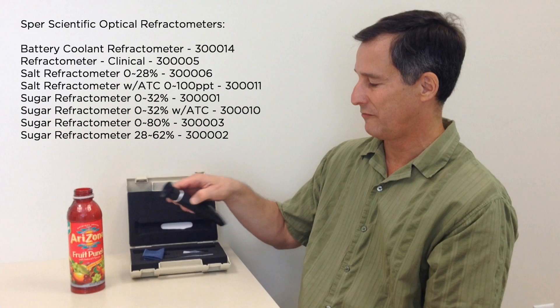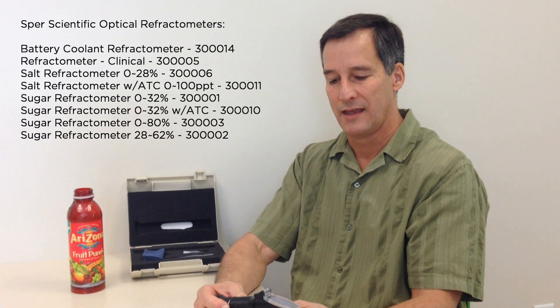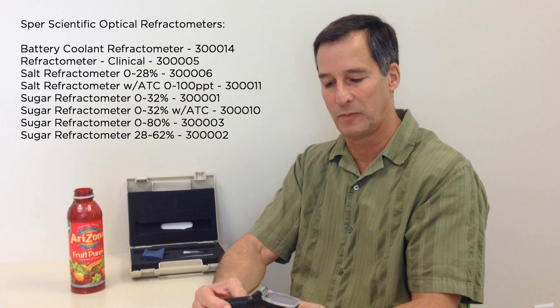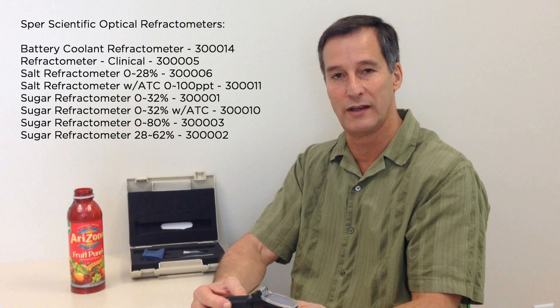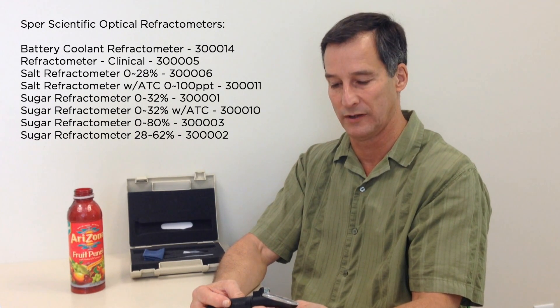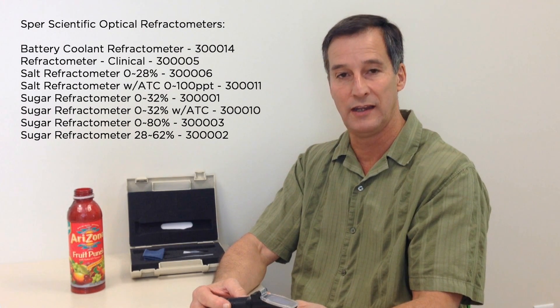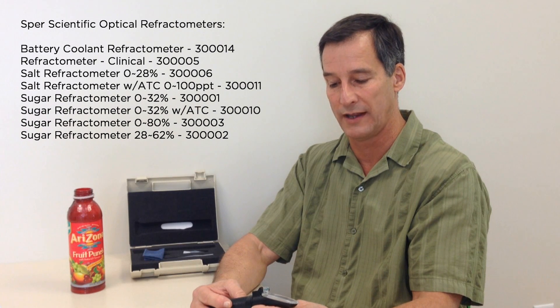Optical refractometers like this one have been around a long time. They provide a very inexpensive, simple, and accurate way to measure dissolved solids in a liquid. They don't require any batteries; they work on ambient light.